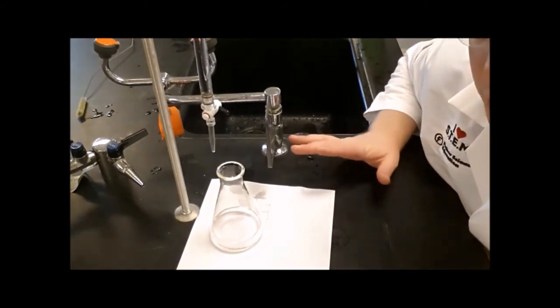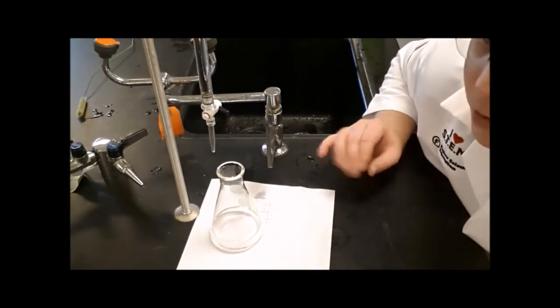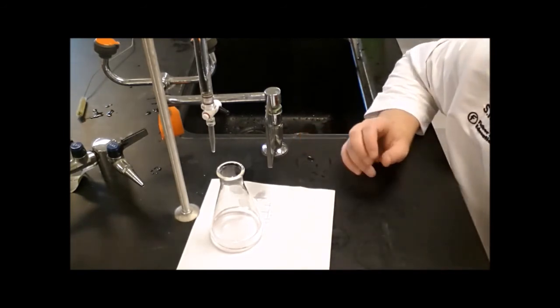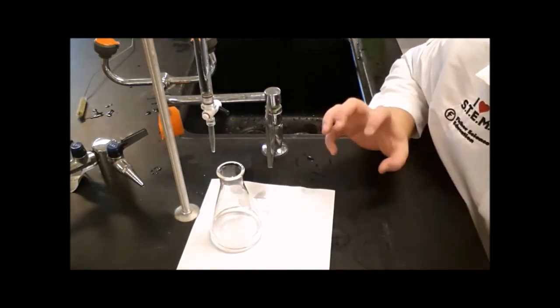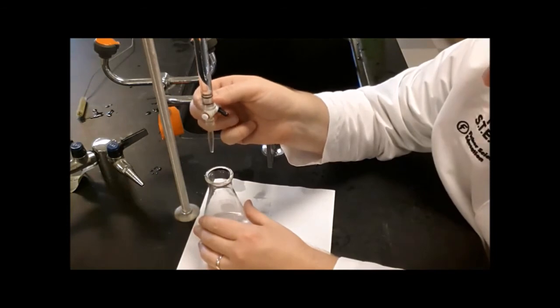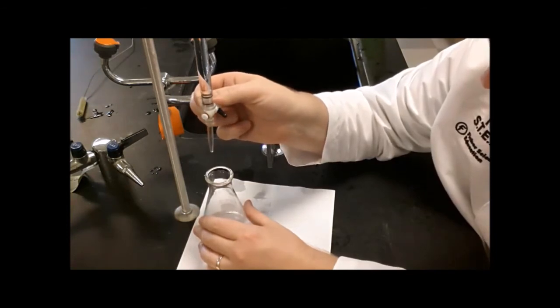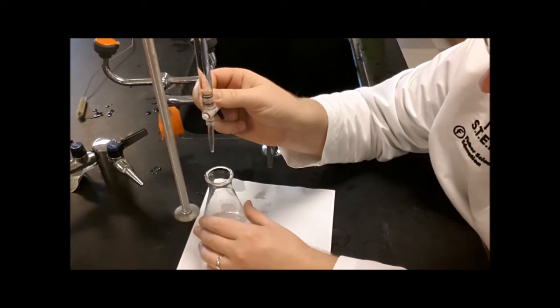Notice that the difference between the color of failure and the color of victory is a difference of only 3 drops. By the time I had let 3 drops out of the stopcock, it had already turned that violent fuchsia color. So I can get this if I'm very slow and very careful. I can get this so only a fraction of the hole is showing, allowing liquid to come through the stopcock. And that droplet starts to form on the tip there.